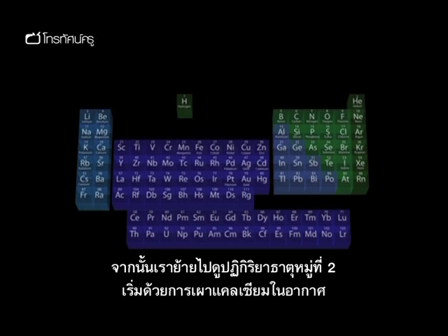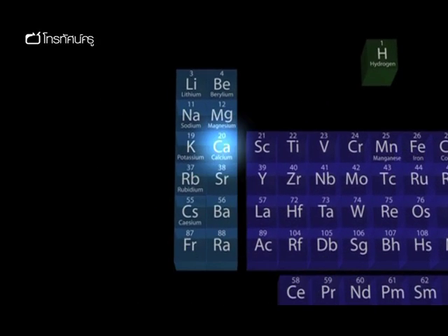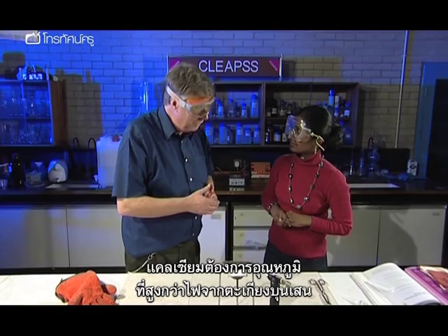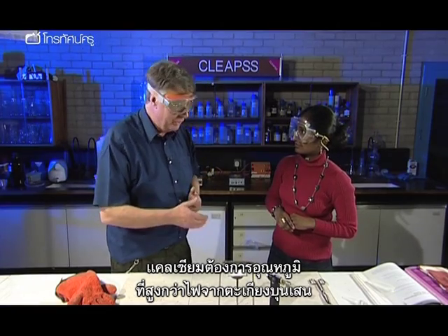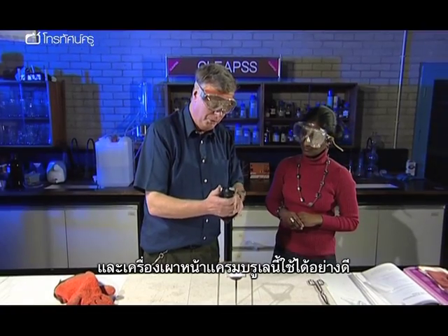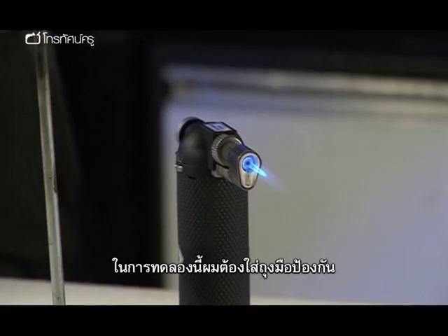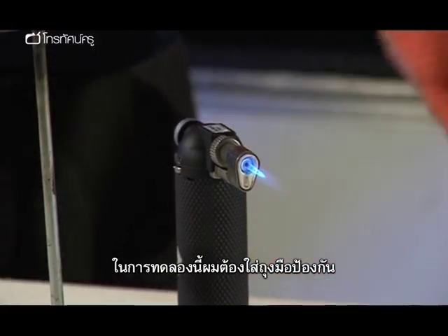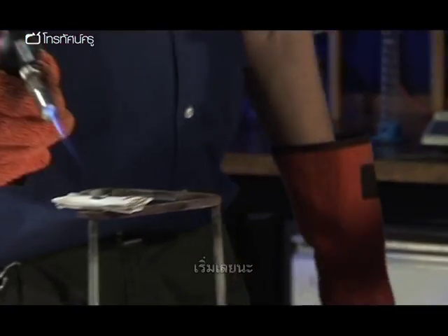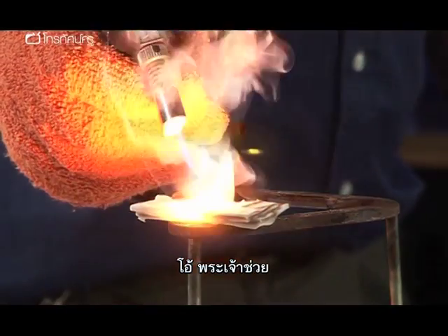We then moved on to some group 2 reactions, starting with burning calcium in air. What exactly are we going to be doing with this creme brulee torch? Well, calcium requires a much higher temperature than a Bunsen flame to get it to work. And a creme brulee torch works really well. Okay. Now, to do this, I have to wear some protective gloves on my hand. Lovely fetching orange? They are lovely, yes. And here we go. Do I have to step back at this point? Yes. Oh my gosh.